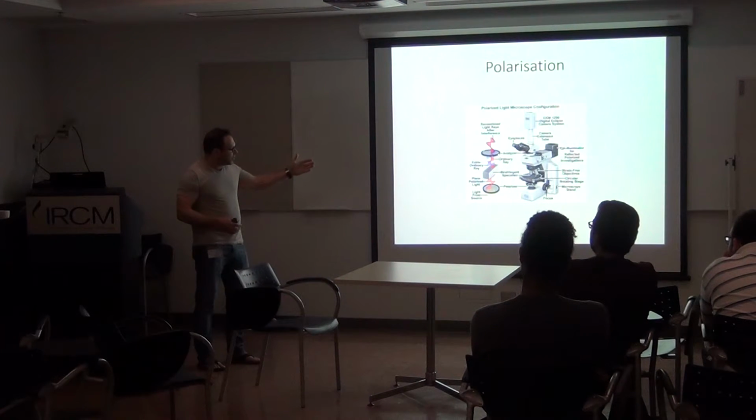Usually you see birefringence in crystals. So some structure. The way the atoms are organized in space, light's going to go really fast in one direction and not in the other direction. And if you look through a calcite specimen, crystal, you're going to see two images.